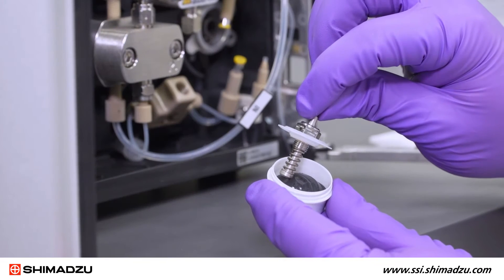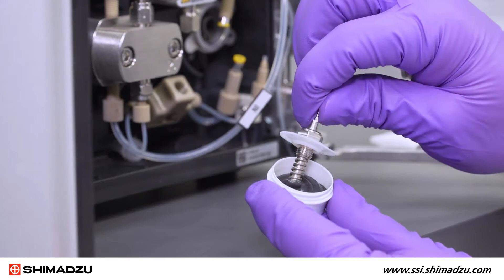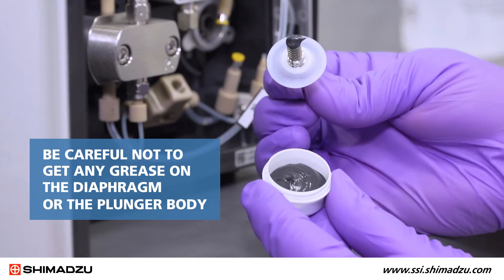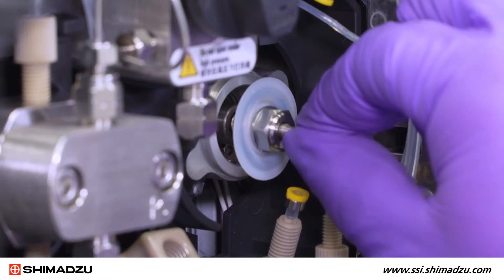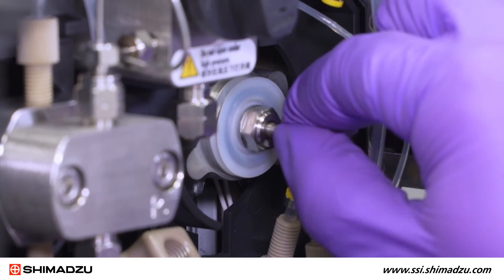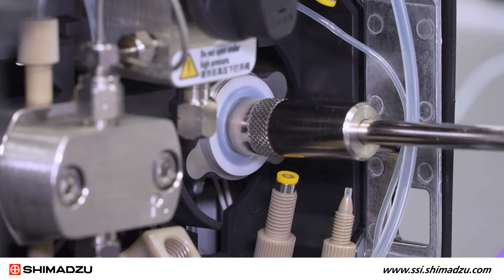Apply the grease provided to the plunger assembly as shown. Be careful not to get any grease on the diaphragm or the plunger body. Insert the plunger holder into the pump body and tighten by hand until finger tight, then finish with the box driver.